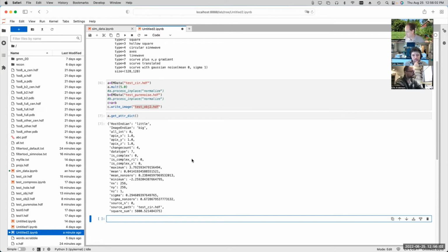If you look at a generic program like MATLAB, it will be able to pull out data objects from HDF files irrespective of how they're structured. Basically, it will look through the entire tree, find all the data objects and let you pull them out. But EMAN will only recognize HDF files that are structured like EMAN files.